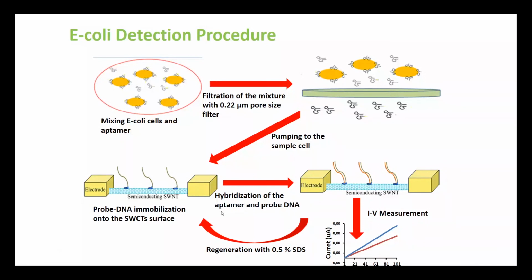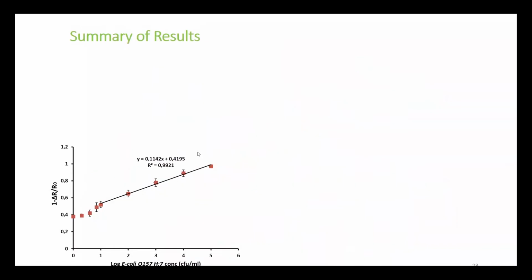In this way, it is not portable. We are not capable of making it portable. We have lots of addition and mixture steps, but it is capable of integrating into a microfluidic system: the mixing in a microfluidic system, pumping through a microfluidic system, binding, regeneration. So it has the capability to integrate with a BioMEMS system.